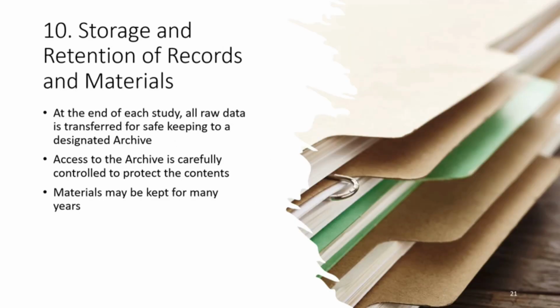Storage and retention of records and materials. At the end of the study, the raw data shouldn't be simply discarded. Instead, they should be properly maintained and archived for future reference, and typically they should be kept for quite a number of years.